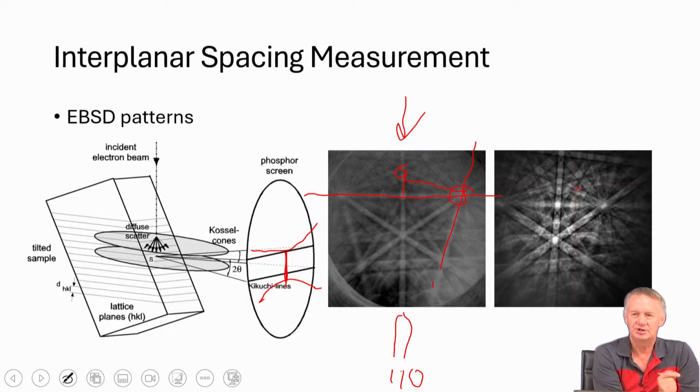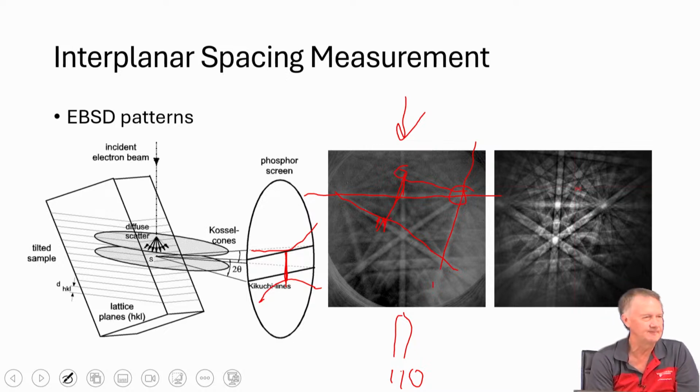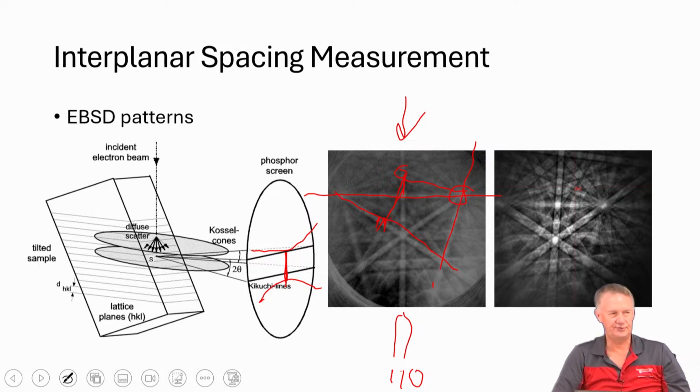So it's just a little bit of geometry you have to keep track of. But as soon as you recognize that you're taking the bandwidth angle, if we're talking about that line, you have to come down here, normal from the pattern center. And then this is where the bandwidth angle will be measured, in that position. Right? So that's clear enough? All right.